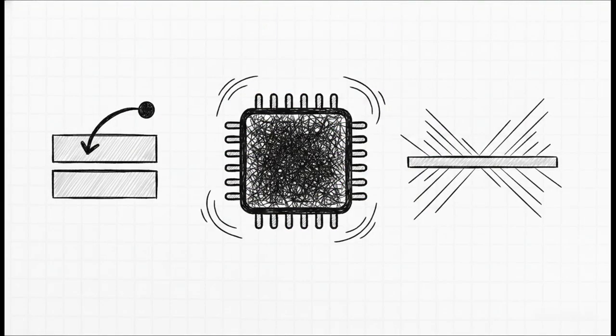Switching gears to high-tech manufacturing, UV-Vis is literally the backbone of modern material science. In the semiconductor industry, knowing a material's electronic structure is everything. Calculating the bandgap energy, which is the amount of energy it takes to kick an electron into a conductive state, is totally vital for engineering optoelectronics and next-gen solar panels. Also, by analyzing the interference patterns of light reflectance, UV-Vis can map out the exact thickness of microscopic thin films on semiconductor wafers for quality control.